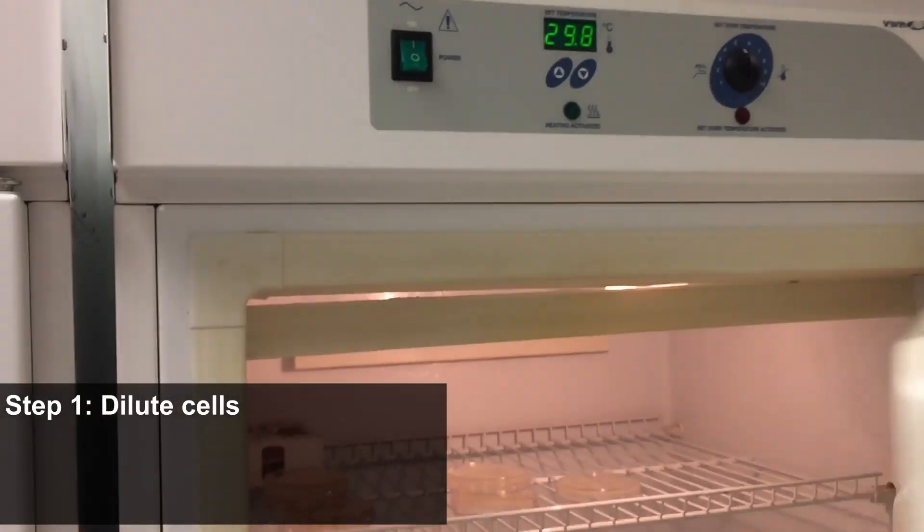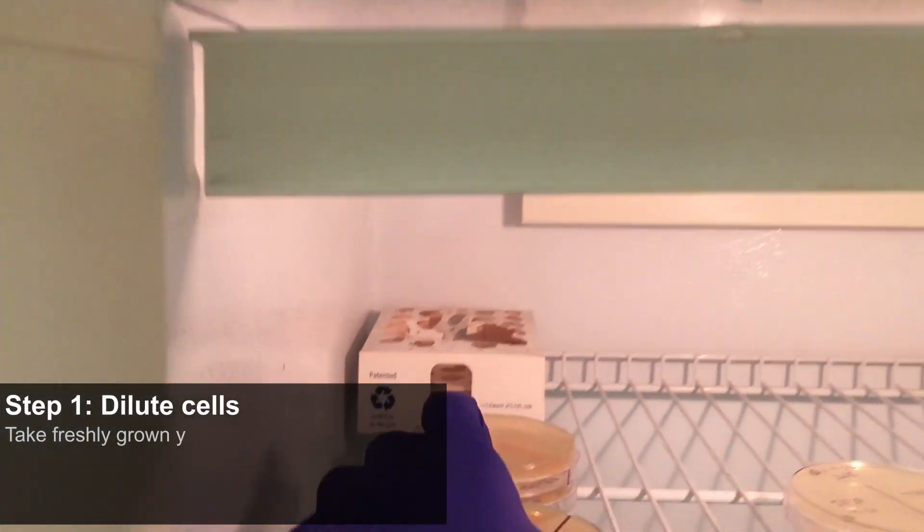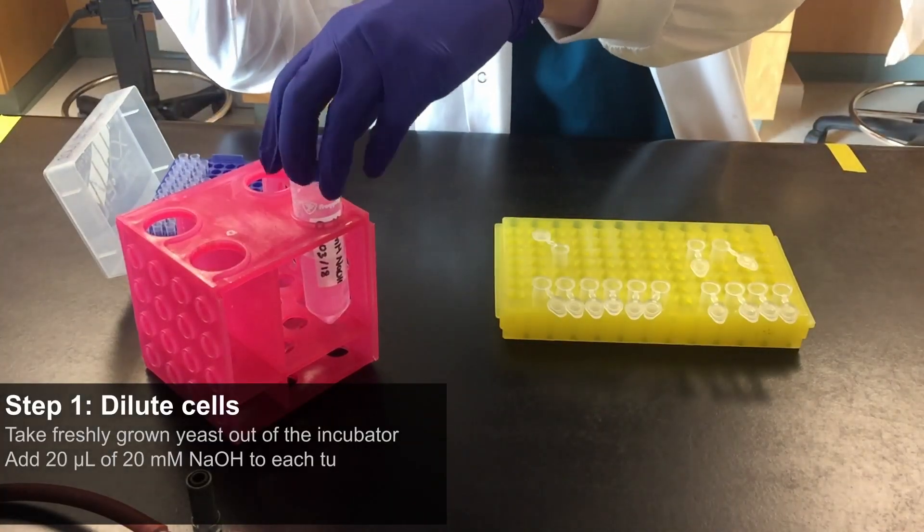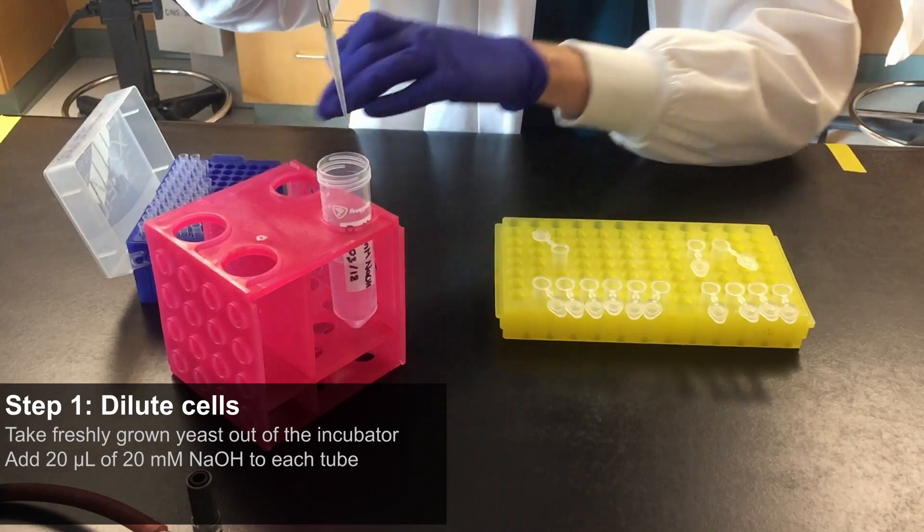Step 1: Dilute cells. Take freshly grown yeast out of the incubator. Add 20 microliters of 20 millimolar sodium hydroxide to each tube.